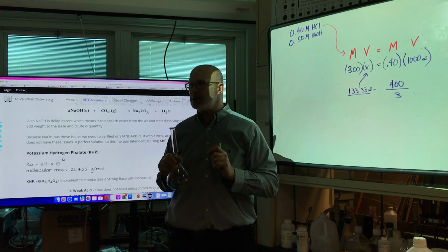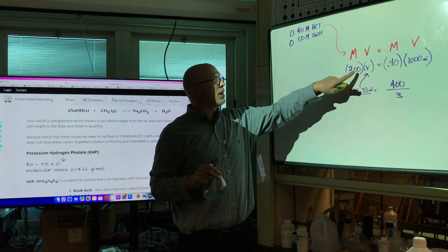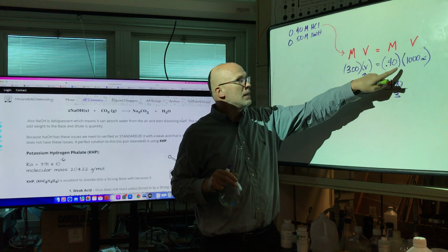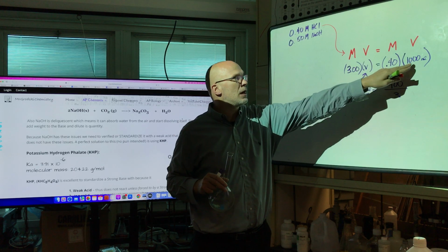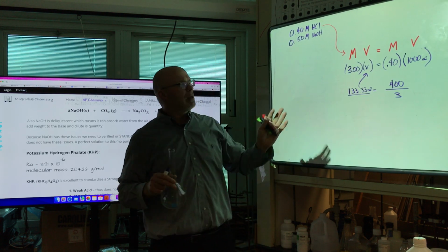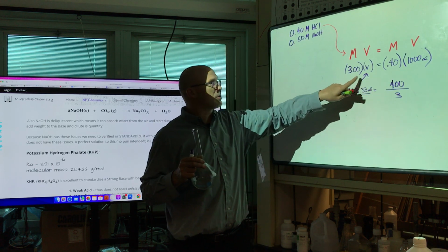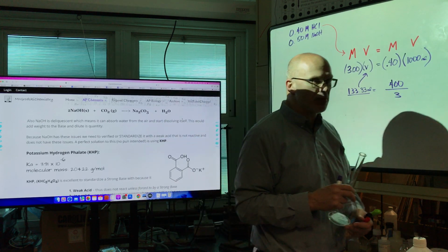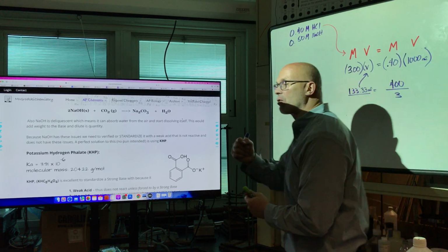because just on that line is now 1 liter. So in this dilution formula, we solve for how much of the stock solution we need. They call it a dilution formula because you're figuring out how much of the more concentrated solution you need to dilute. People mess this up all the time. They know how to solve this easy math, but they don't know what it means. We're going to dilute this to this value. You notice we're starting with 3 molar, and now we're down to 0.4. Okay, and I have that solution made. And of course, today we're going to measure 100 milliliters of it to add to our tabs that are crushed.